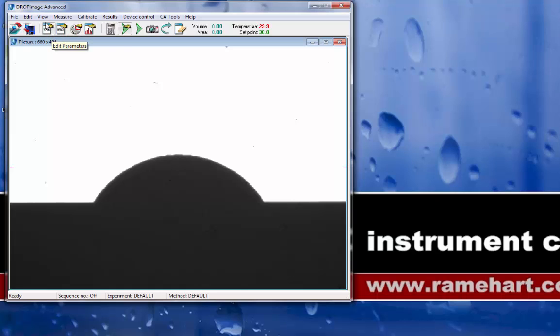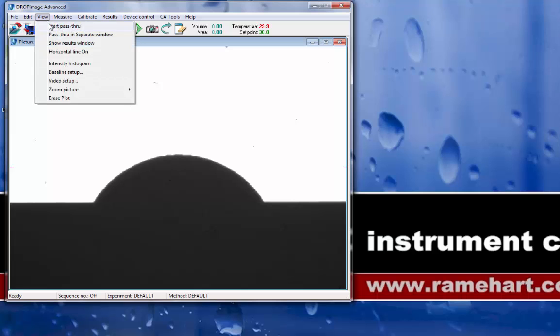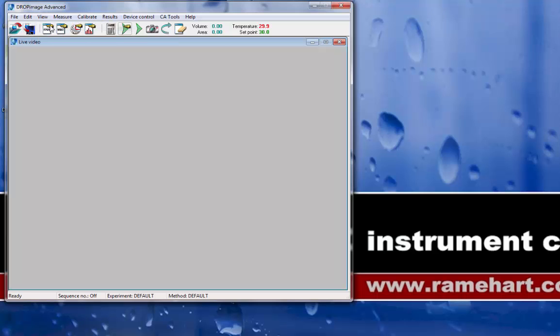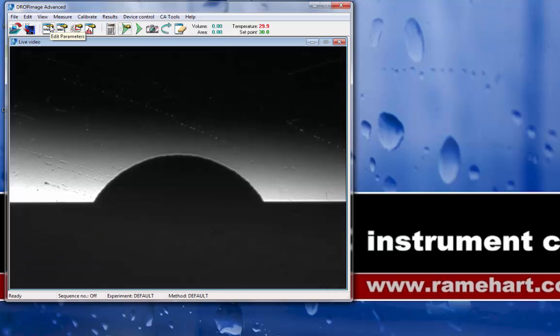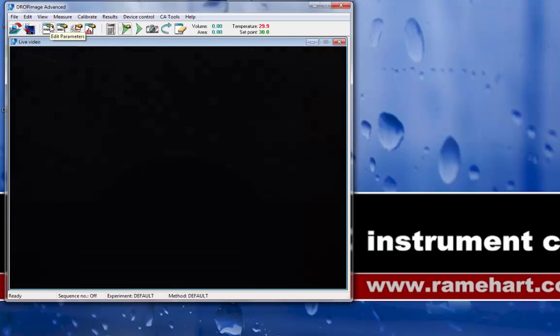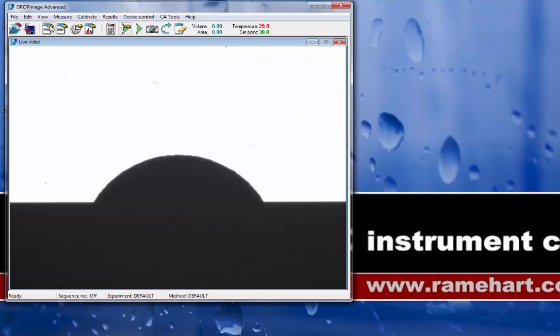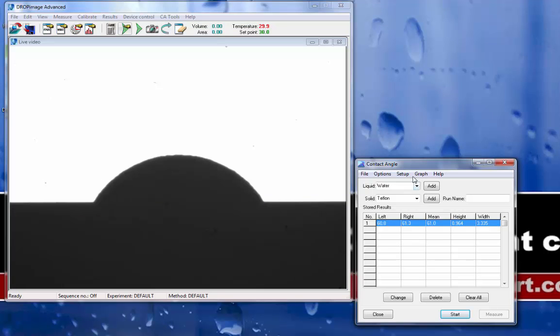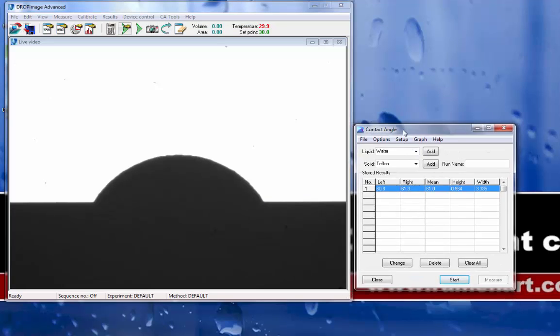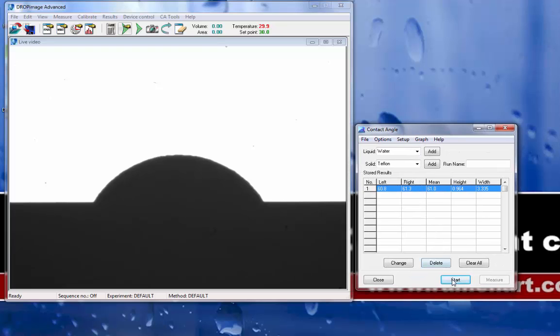Now, when I click on View, Start Pass-Through, my live video is in the main window, and I can, in fact, take measurements in this window.